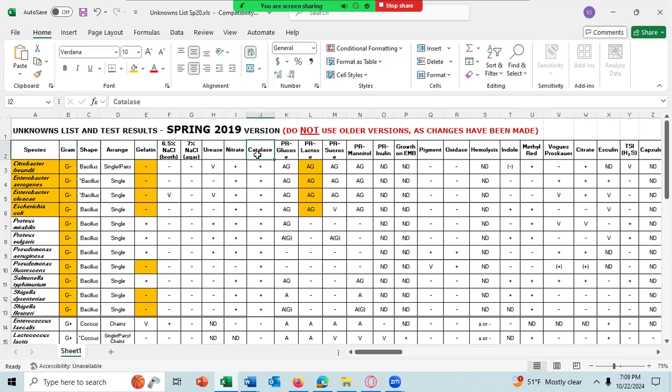The catalase, the oxidase test. There's one other test, I don't remember what it is. There are 3 tests that you can get back within a day. Pigment test, there it is there. Within a day or less. The exception would be like oxidase. If your cells are very old, I will require you to grow new cells, and that'll take a day. But you should get the results within a day.